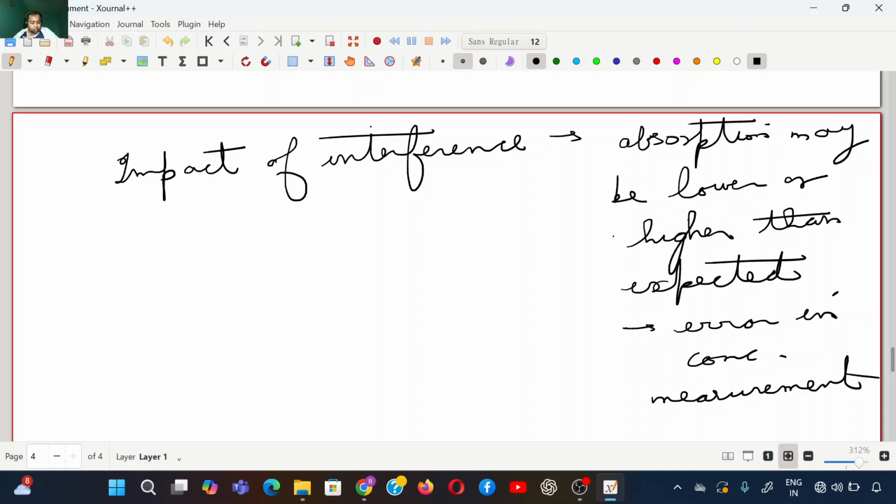Okay, so basically we talked about what FAS is, what aspiration is, what the procedure is, what steps you have to follow in this instrument, and a little bit about flame chemistry, etc. So we have a short break, and after that we continue.